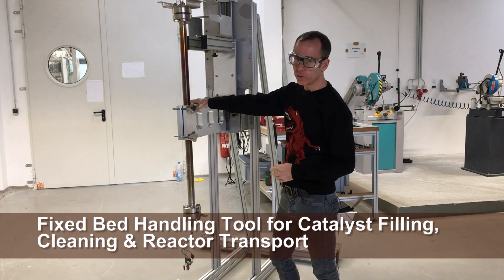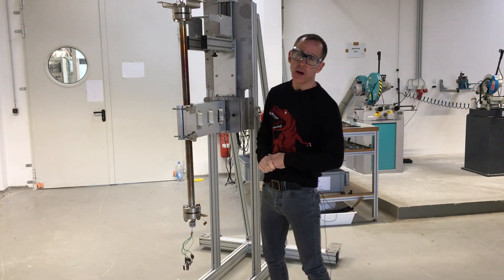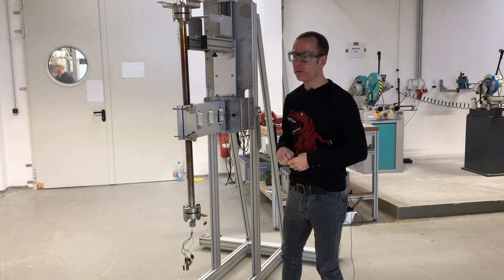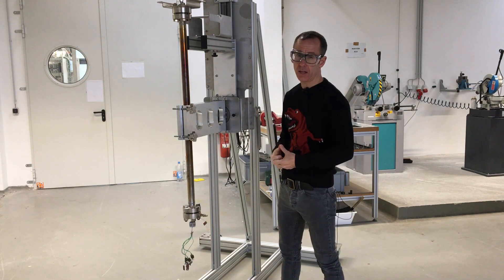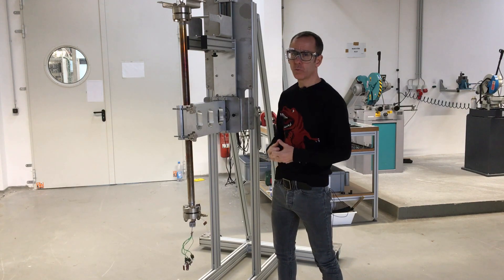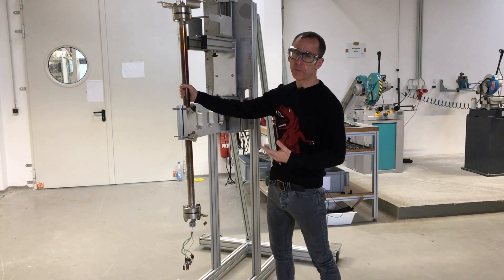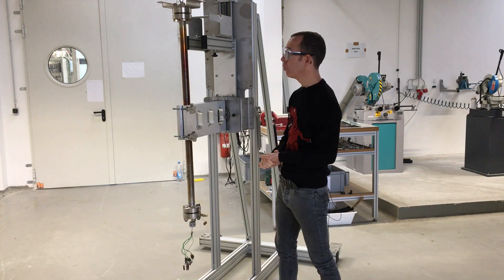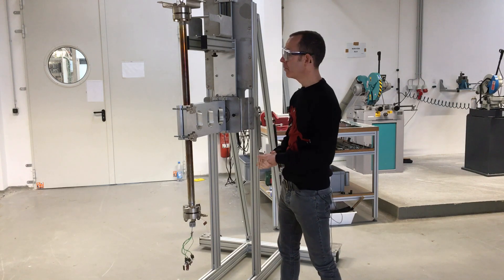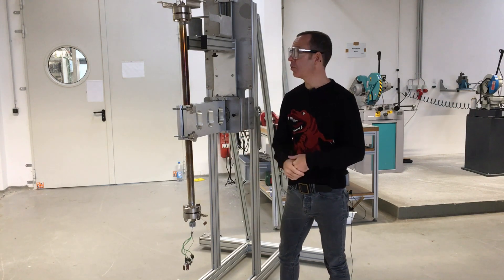We're talking about a tool used for assisting us with working with fixed bed reactors. At ILS we make a lot of micro-pilot units, in particular for doing things like trickle flow testing of HDS catalysts. One of the difficulties with these types of units is that you're working with fairly large reactors, typically length scales of one to two meters, diameters on the order of one to two inches. The reactors are quite heavy — they're high pressure reactors, typically one to two hundred bars.